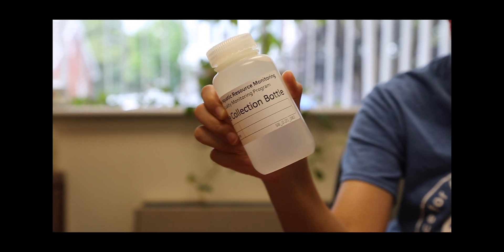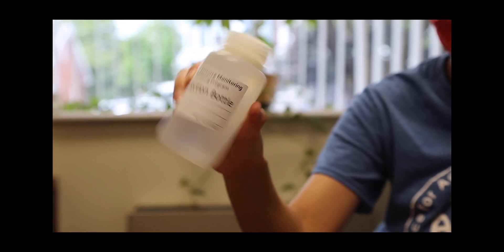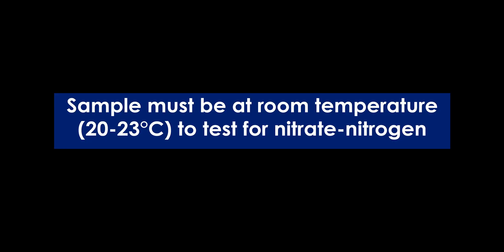To begin your nitrate-nitrogen test, invert the sample water three times to make sure the sample is mixed. It is important to note that your water sample must be at room temperature prior to testing it for nitrate-nitrogen. This is between the temperatures 20 to 23 degrees Celsius.